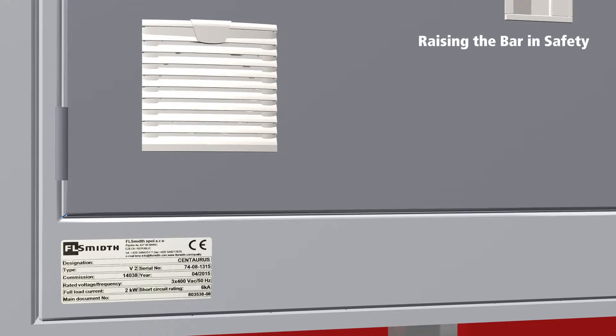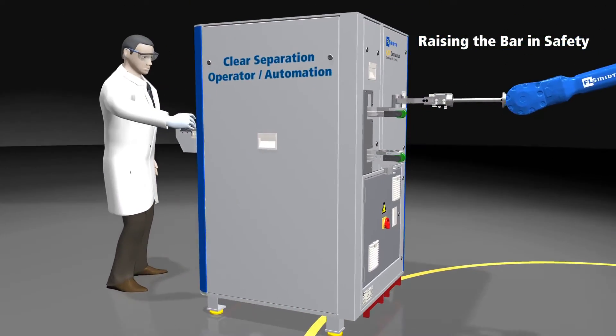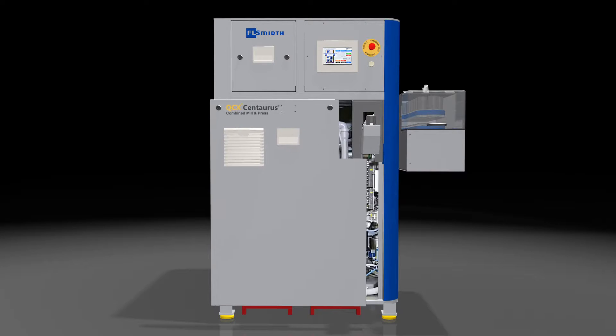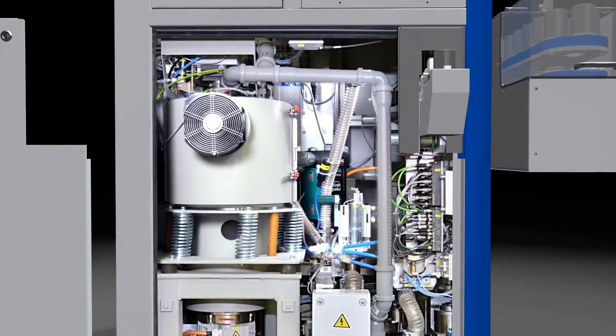The Centaurus is compliant with the latest international safety regulations. The Centaurus incorporates the most efficient laboratory mill and it can be fully controlled for optimal performance — the most powerful and efficient mill in the laboratory class, fully controllable, providing optimal performance.